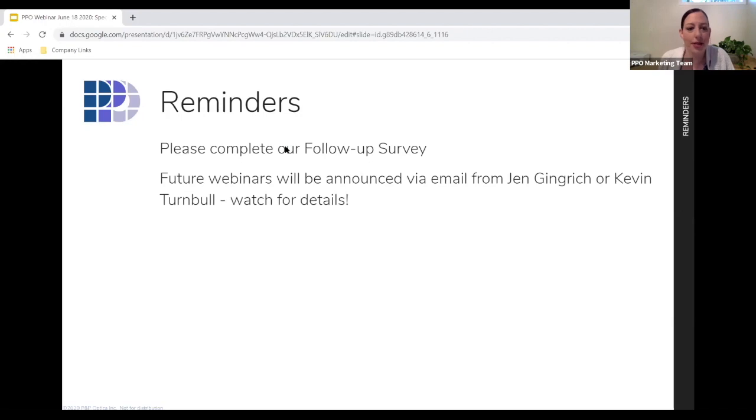That's awesome, Priya. Thank you. And Michael, just a follow-on question for you. I know you've been in the food plant and done this yourself, but once Priya's done all her work and we've sent it, if we had to swap out a light or had to swap out a spectrometer, how long does that usually take on the system?